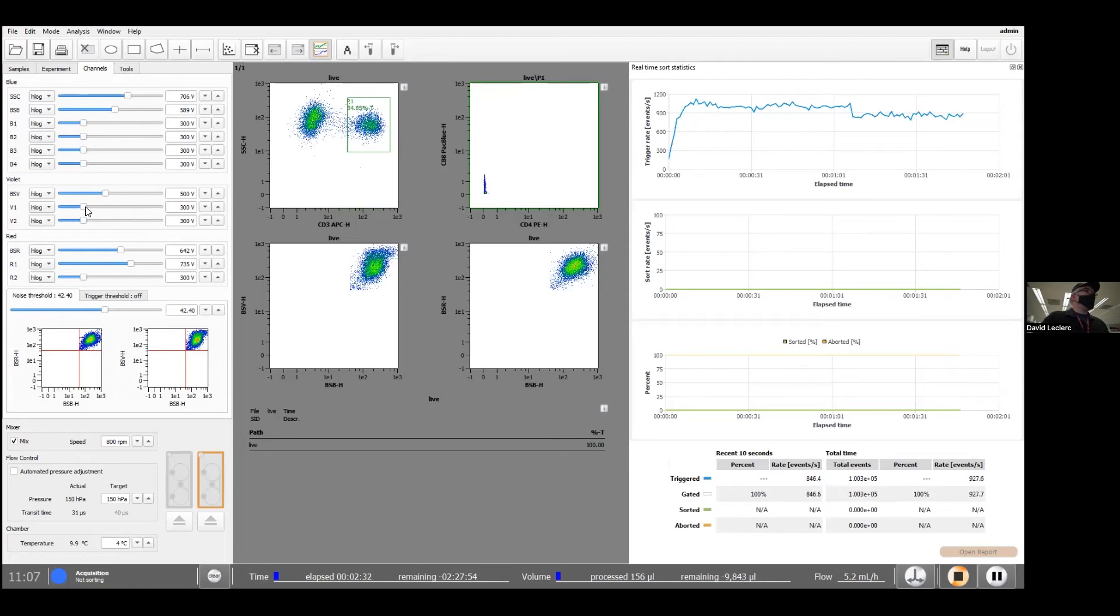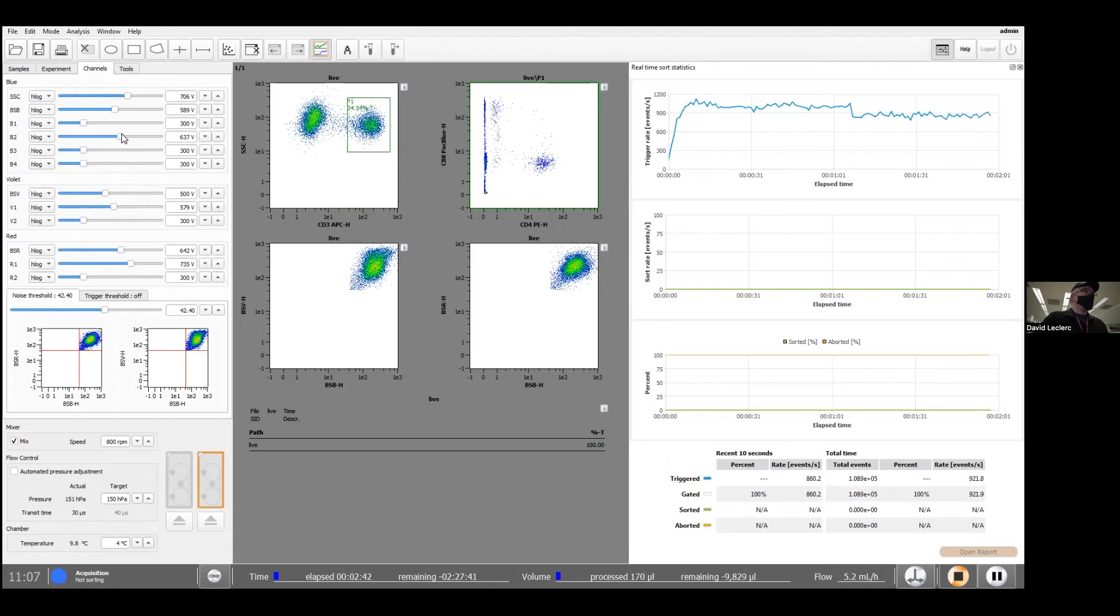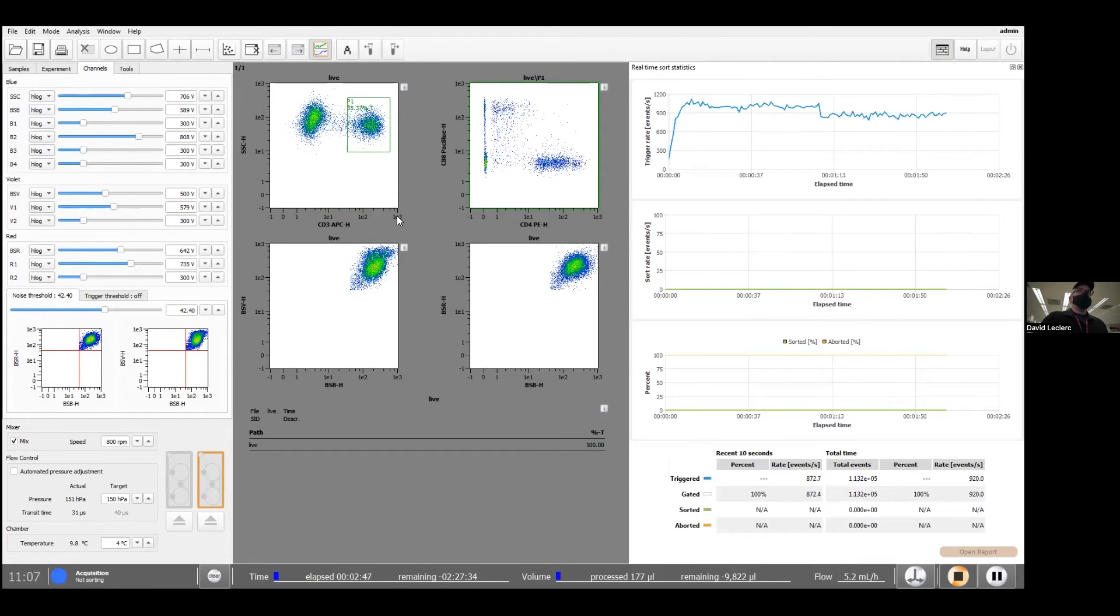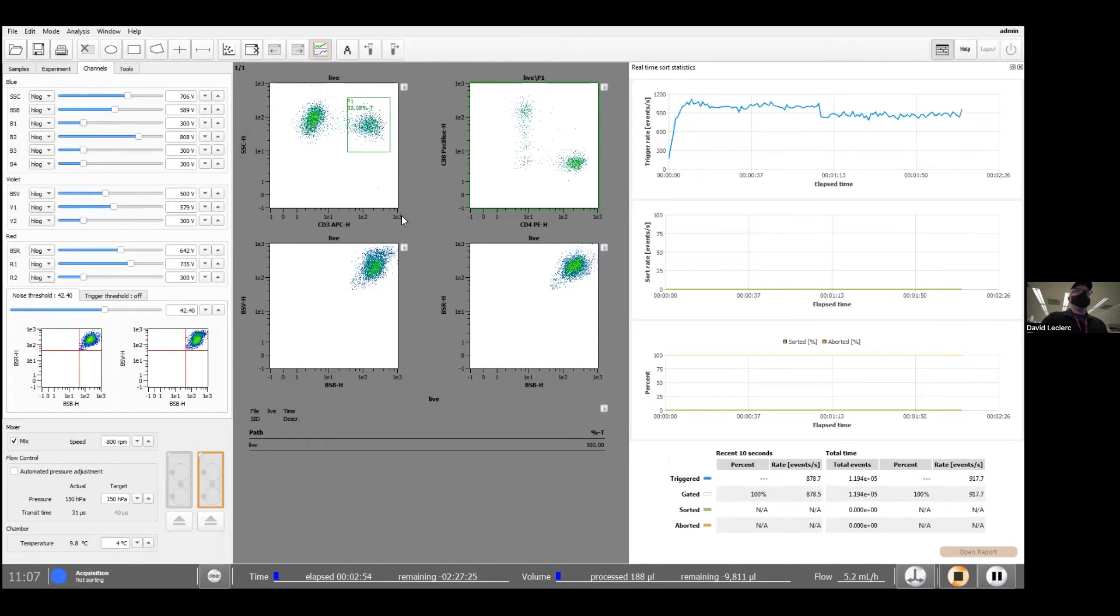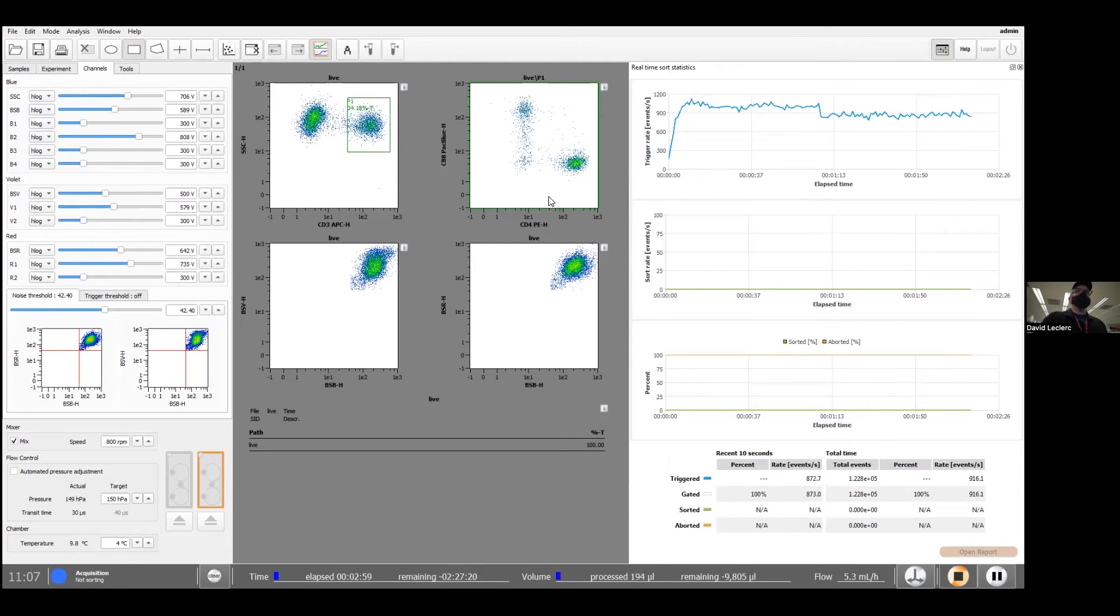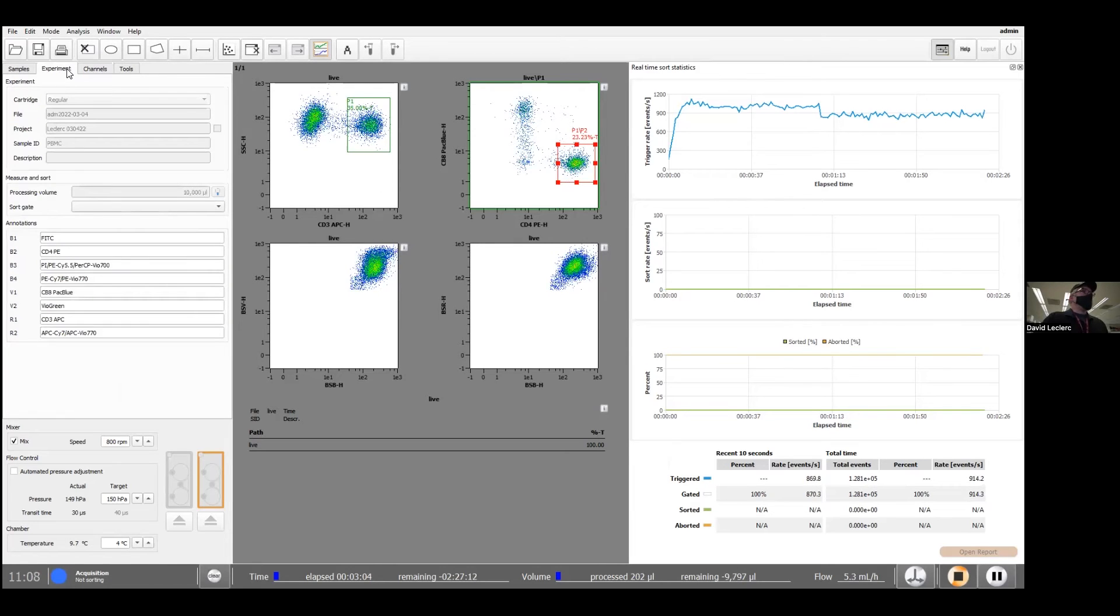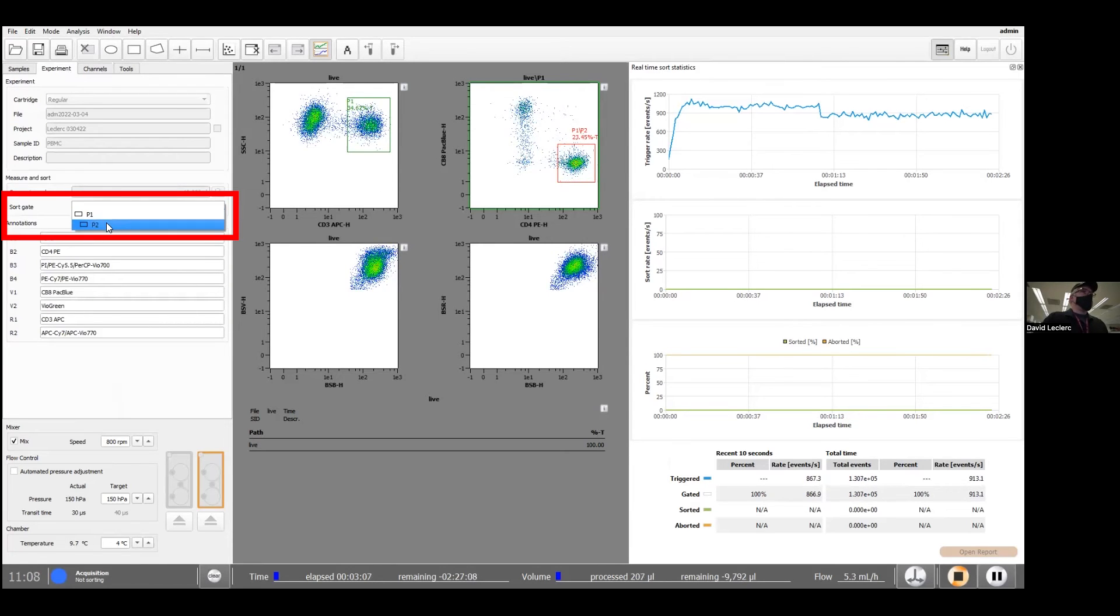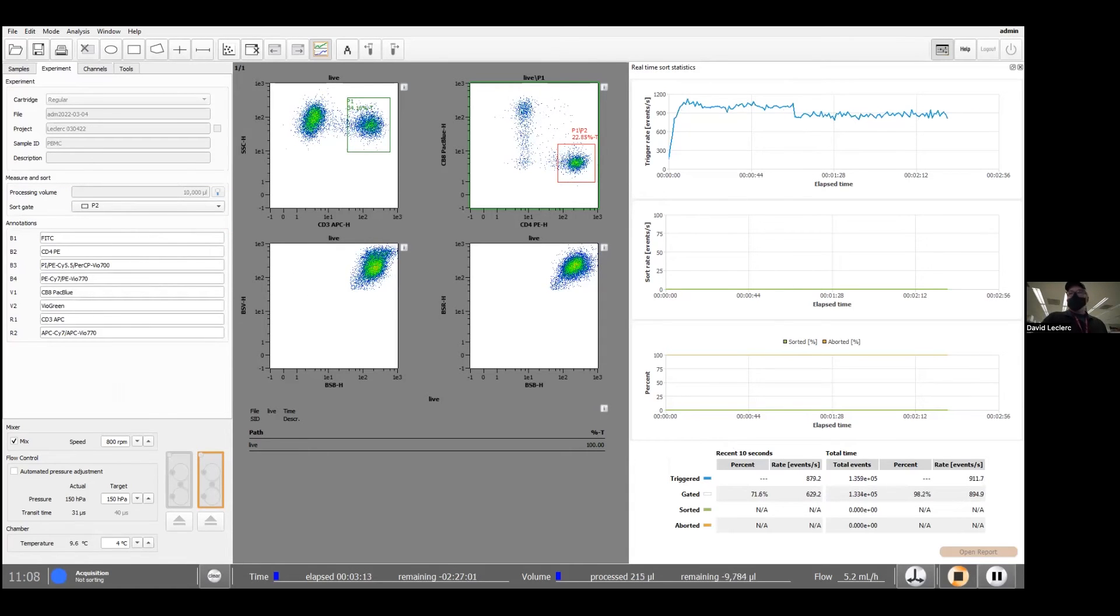Now we can deal with the other two detectors. And typically I'll try to get this signal pretty bright. So somewhere around exponent 2 or something like that. And let's say we want to sort our CD4 positive cells. Now I can go back to experiment and the sort gate would tell the software to sort my P2 region. At this point we're good to go, so we're going to click the sort button.